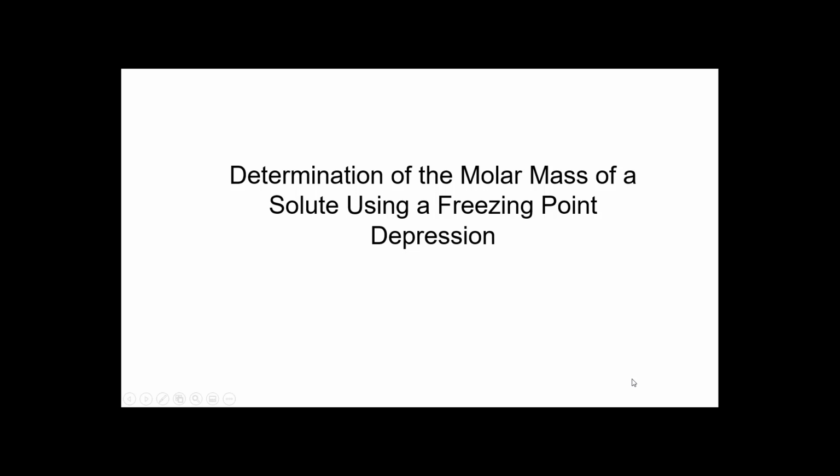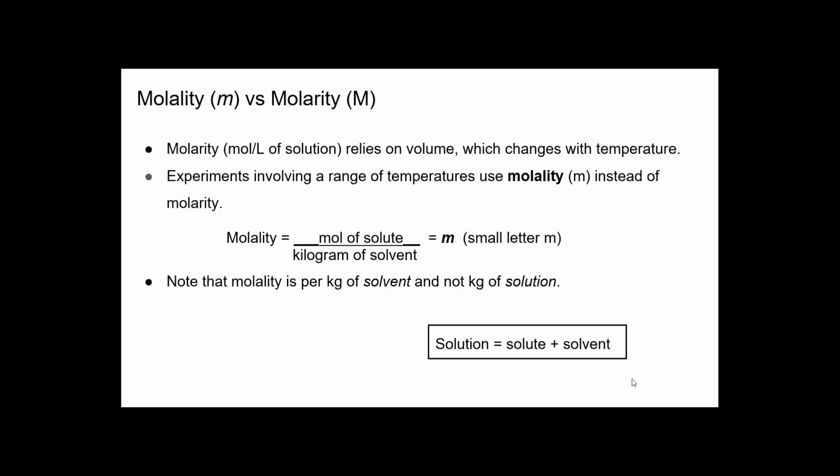Hi class, this week we are doing a determination of the molar mass of a solute using freezing point depression. This involves chapter 13, so if you want more information, I suggest you start reading it now so that it may help you understand. I did give a lot of detail in this experiment because we haven't covered this section yet though.